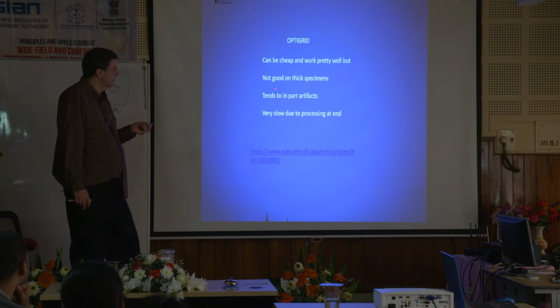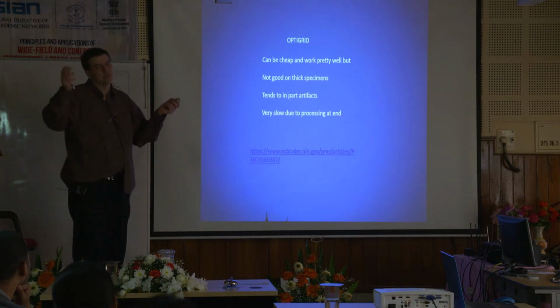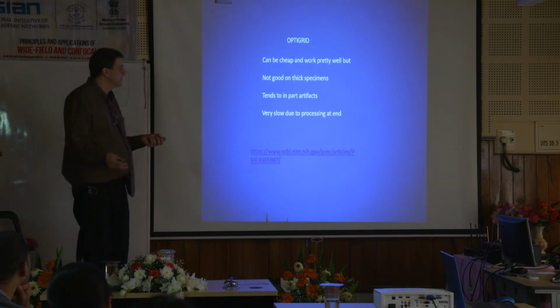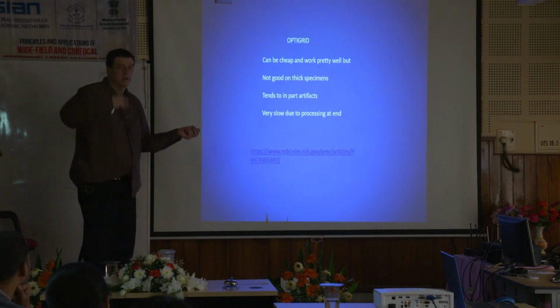It's not really good on thick specimens. It tends to impart artifacts, and it can be very slow because of the computer processing. But I'm thinking this isn't so bad now because the computers are so much better. But it's just a different variation on confocal. I don't know if I'd truly call it confocal, but you get definitely confocal-like images. I mean, I guess you could argue, is it, isn't it? But it's another variation, and it's another cheaper alternative.